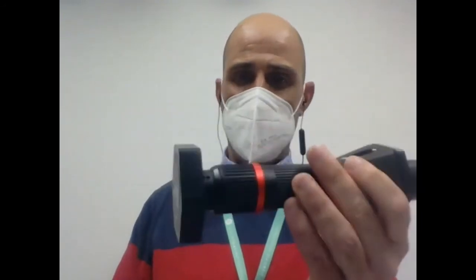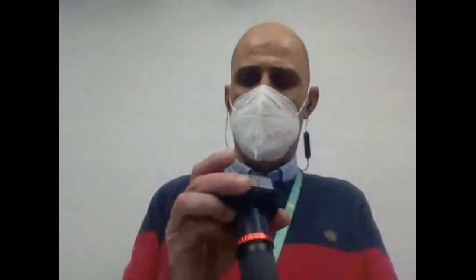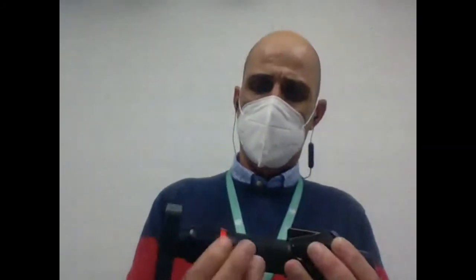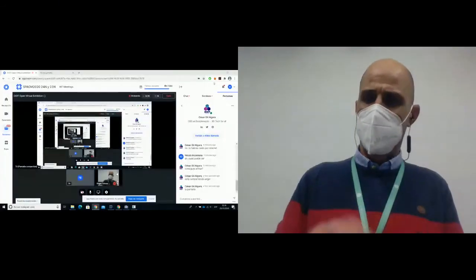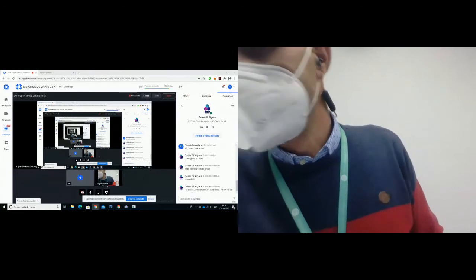Okay, let me share the screen. Once you have adjusted your sample, and once you have adjusted the position of the microlens array, we have to say that this is an operation that you just have to do the first time you use your plenoptic eyepiece.